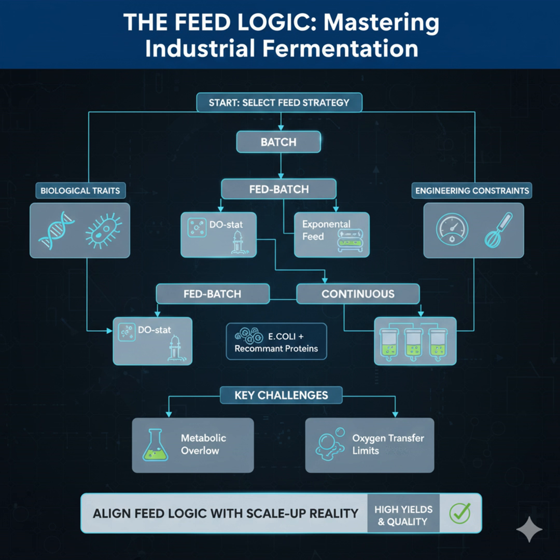Or maybe something else. Or perhaps mild carbon excess, which would allow for rapid biomass buildup in a growth phase. Or in some cases, you want intentional excess because you actually want the fermentative overflow to produce your final molecule. And that intention guides the choice of control philosophy, which we can sort of categorize by complexity. So let's start with the simplest.